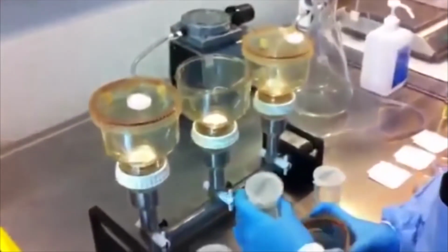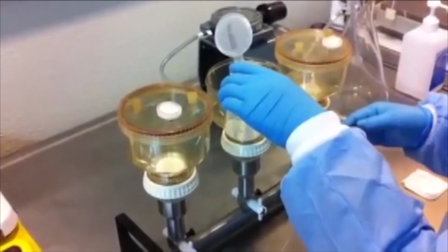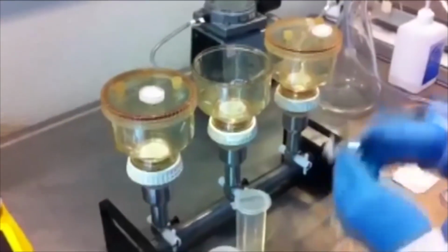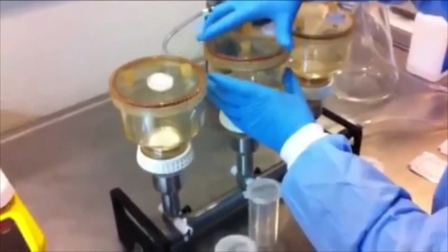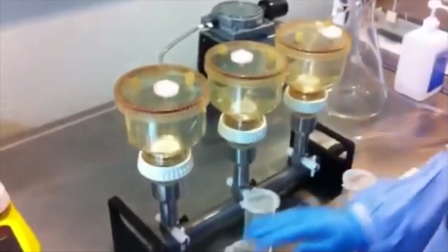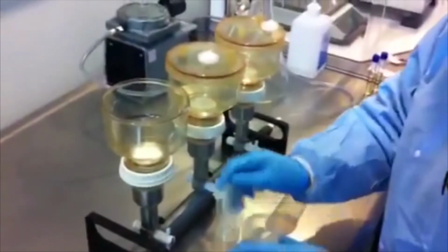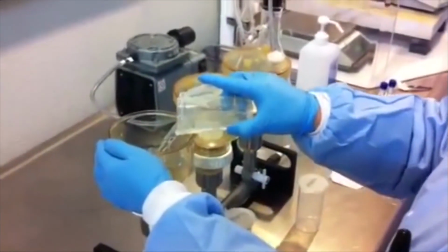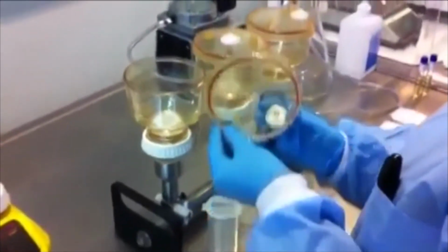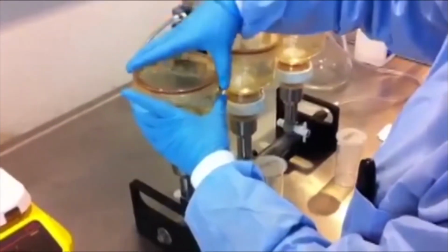All right, and here we are adding the next dilution vial. Once all the solution is added and we turn on the pump, it's going to pump through the filter, collecting the bacteria on the membrane filter for testing. And then the final one. And she pours it in. Okay, this is not the Sartorius system, but it gives you the general idea of how membrane filtration is done.